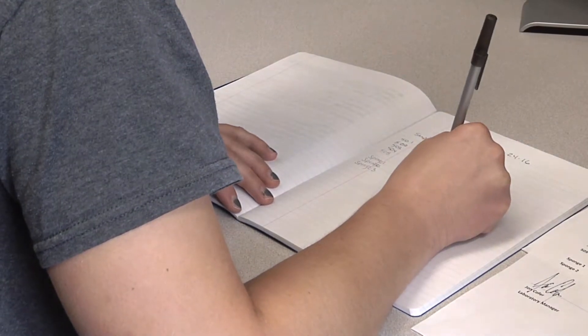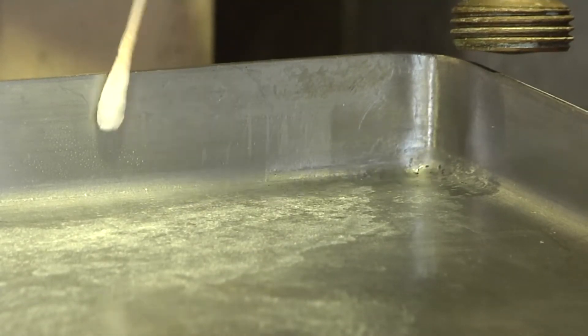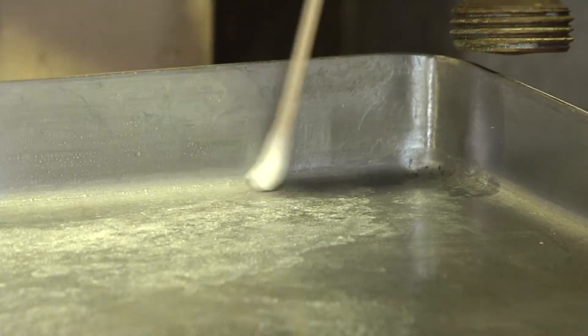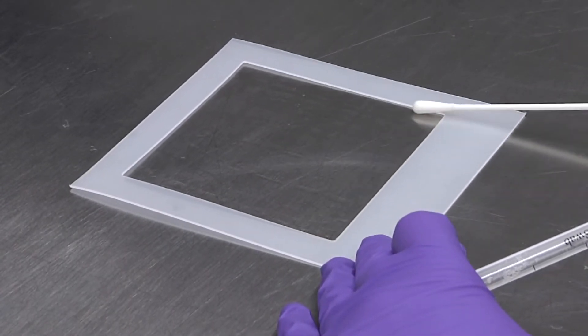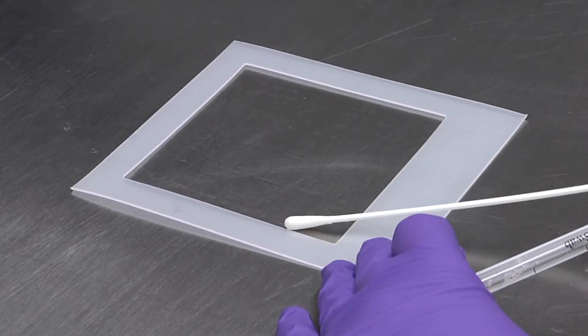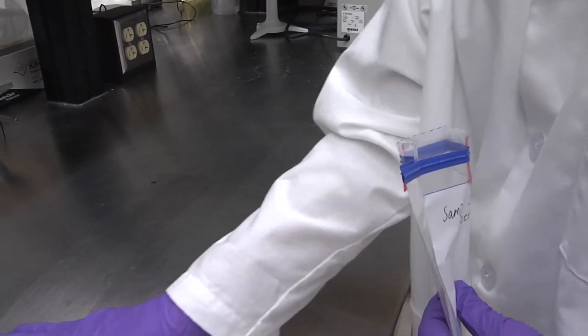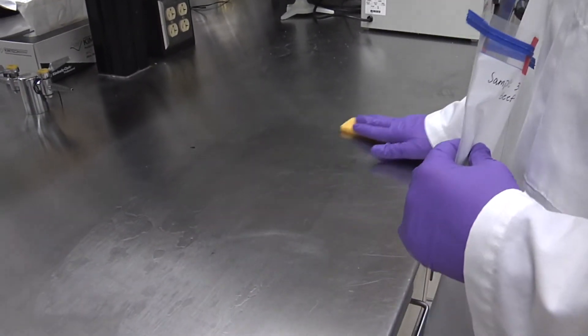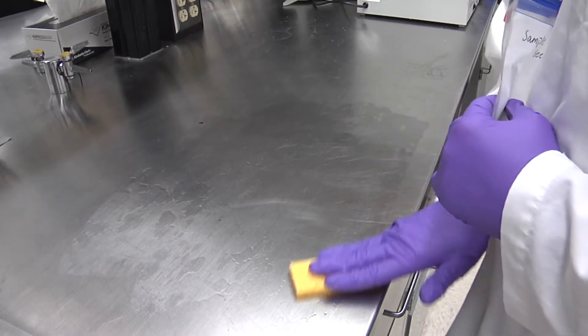Environmental sampling is an important verification procedure. When properly done, swab testing can provide evidence that your facility is being cleaned properly. Sponge testing for pathogens can help determine if there is a pathogen contamination issue in your facility.